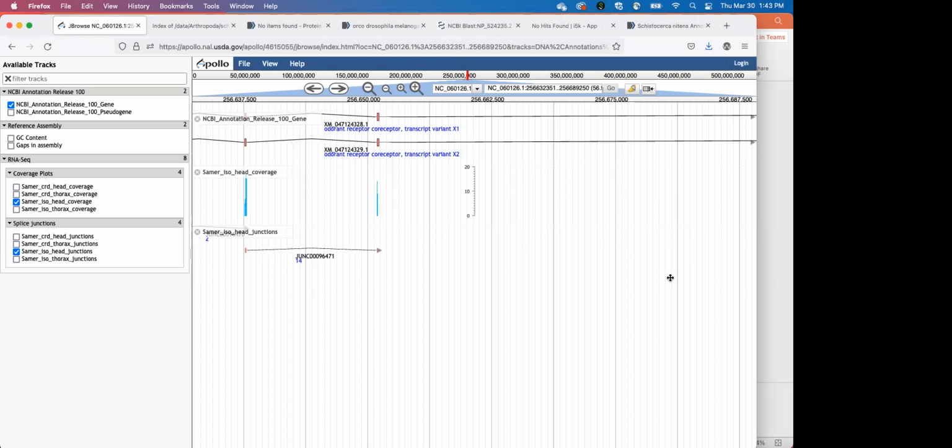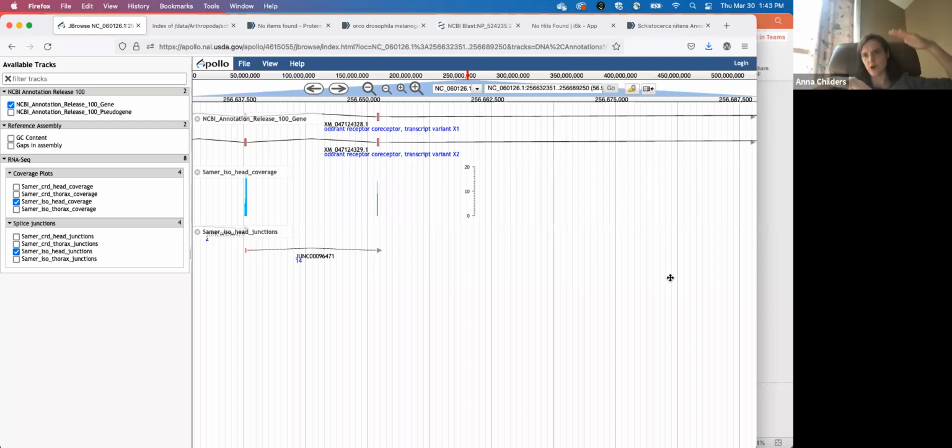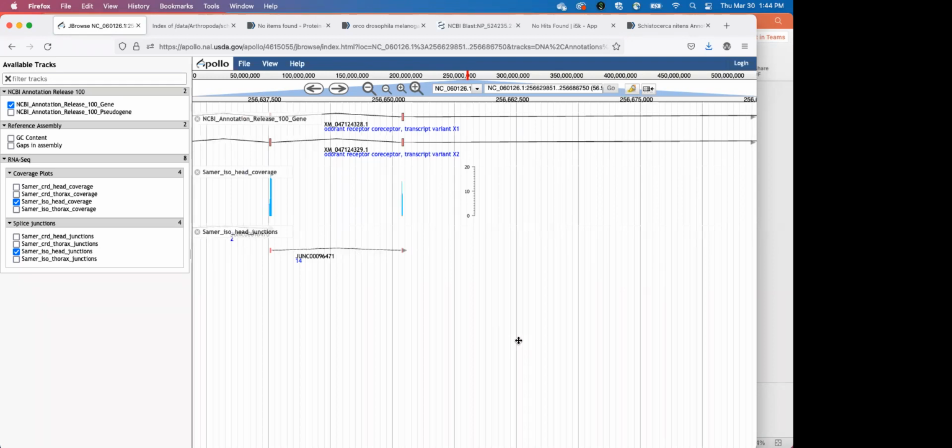Yes, that's true. That is not a completely accurate reflection of the actual number of reads that originally. But you still don't want wild swings. You don't want it to go from 10 to 0 to 10 or something like that, or 10 to 1 to 10. Yes. Does that make sense? Okay.